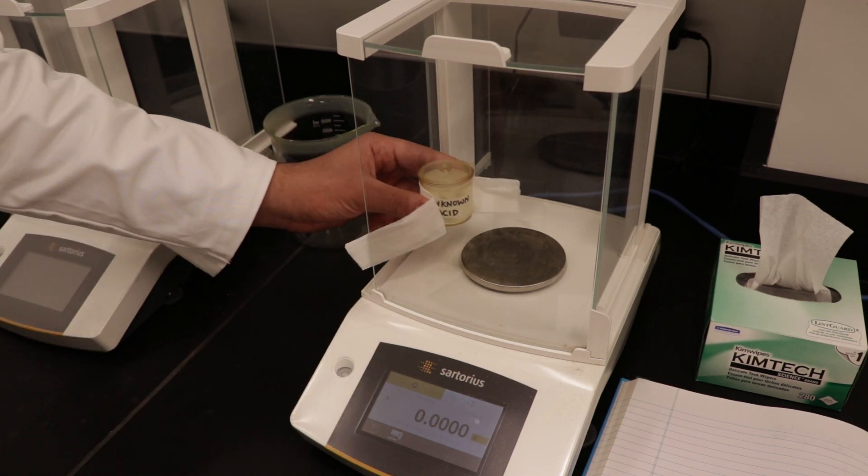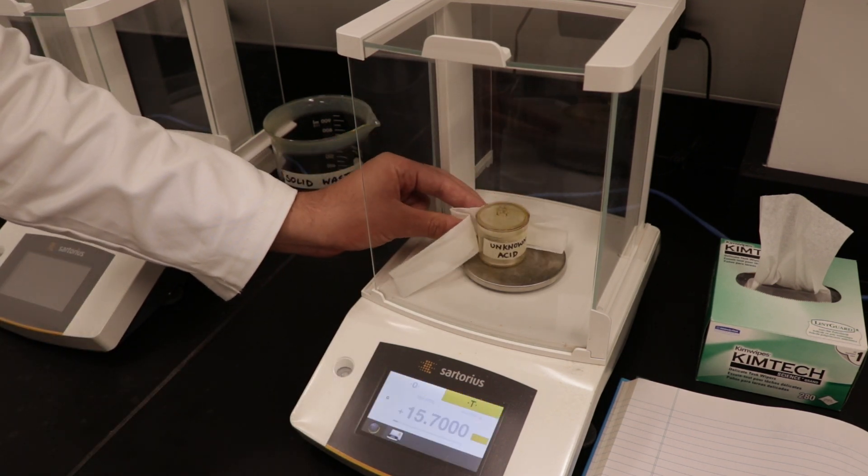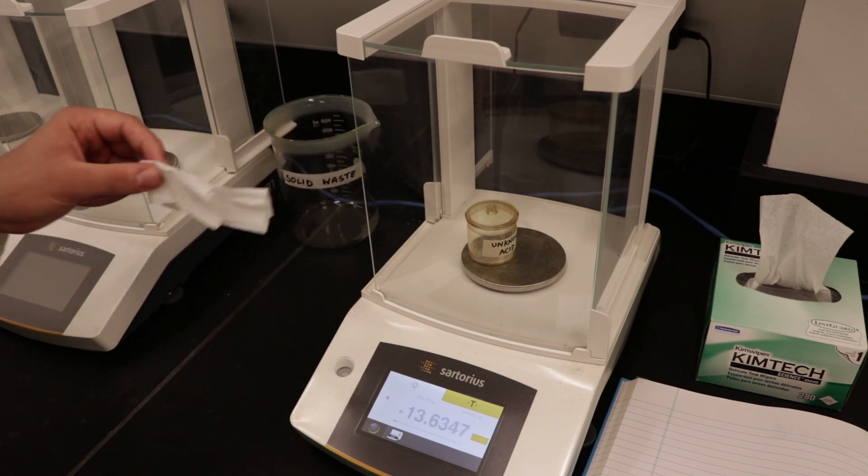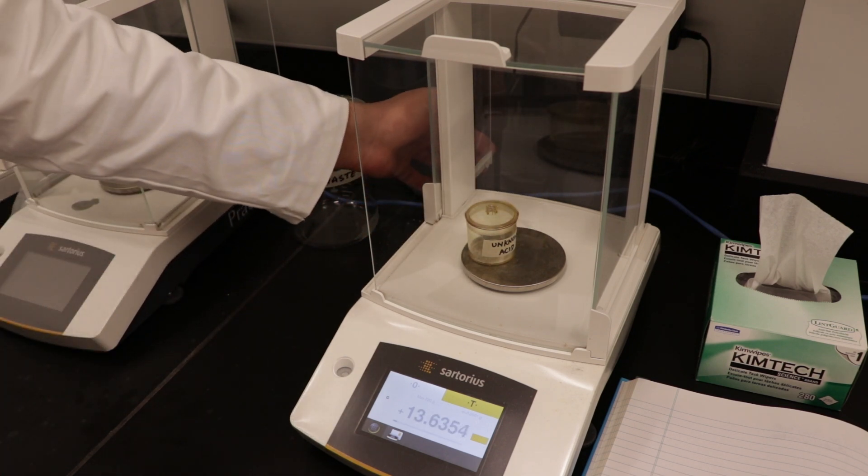Carefully replace the lid of the weighing bottle before returning to the analytical balance. Place the empty bottle back in the same balance and record the mass of the empty bottle.